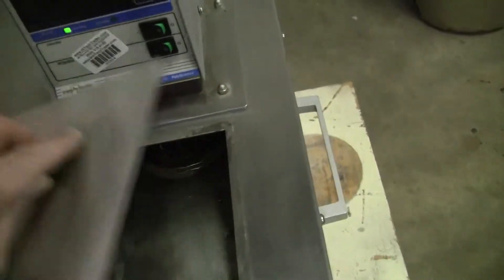We haven't cleaned it yet, but the dirt inside will come out. That'll come out fine, and we'll be able to ship this out.